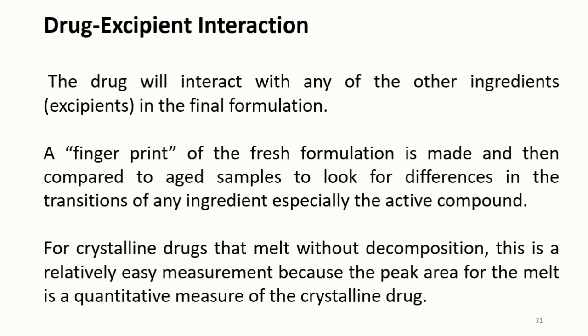It is usually the responsibility of the drug formulations group to determine whether the drug will interact with any of the other ingredients in the final formulation.